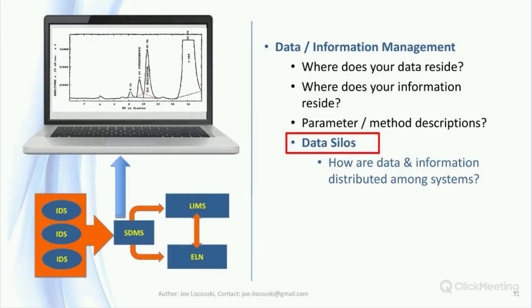One thing that would be useful across techniques, and it may exist with some vendors, are data viewers for analytical data stored outside an IDS, perhaps on a scientific data management system, for example. A package that would allow people to examine data in detail. This would be different than the charts produced in PDFs along with results reports. Those graphics are condensed views of data and don't permit zooming in on areas of interest.